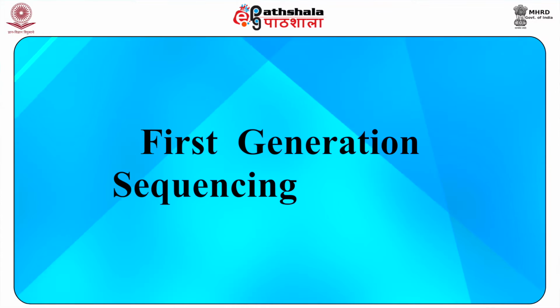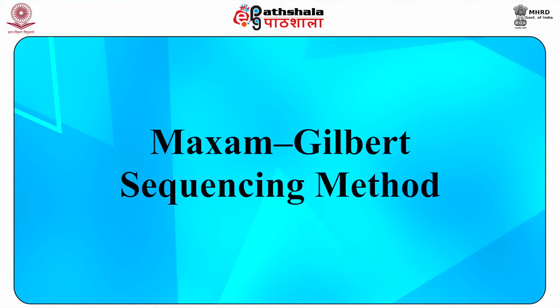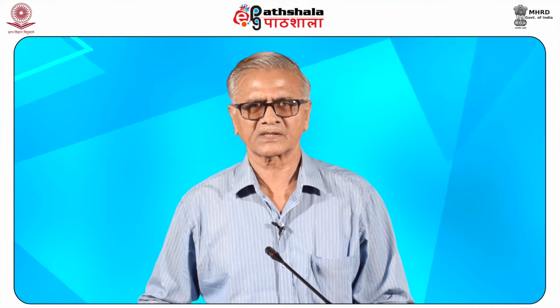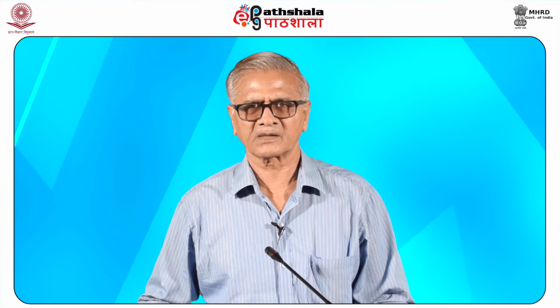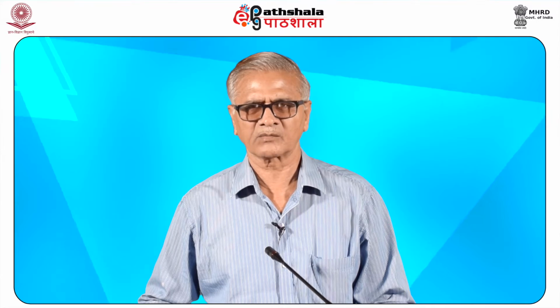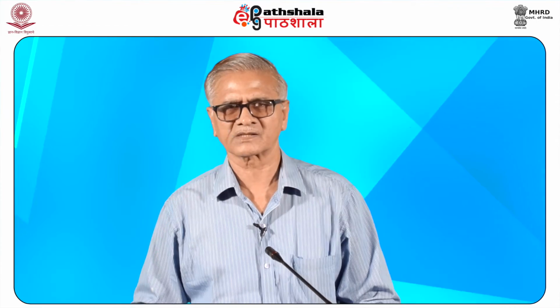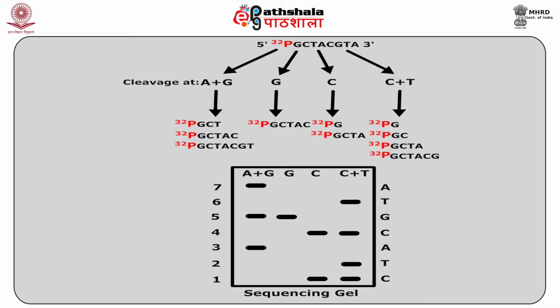Now we talk about first generation sequencing methods. In this, the first is the Maxam-Gilbert sequencing method. In the year 1976 and 77, Alan Maxam and Walter Gilbert developed a DNA sequencing method based on chemical modification of DNA and subsequent cleavage at specific bases. The method requires radioactive labeling at one end and purification of the DNA fragment to be sequenced.